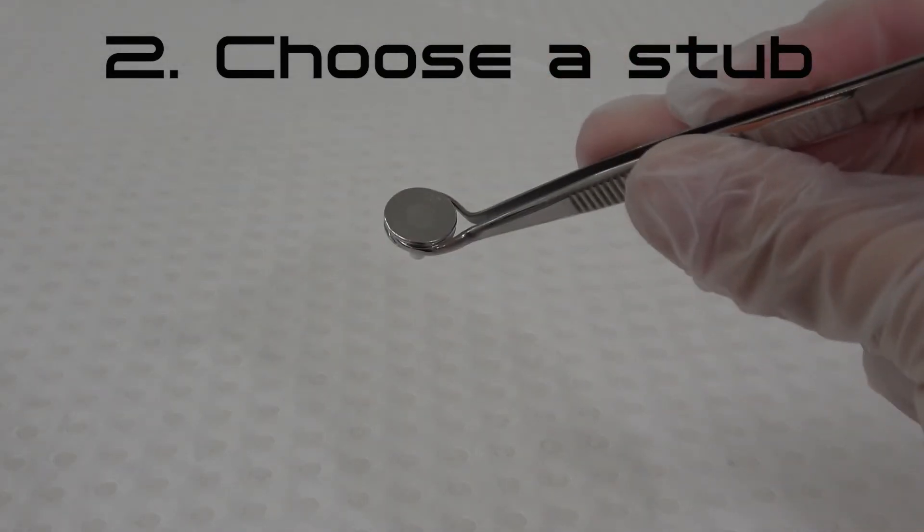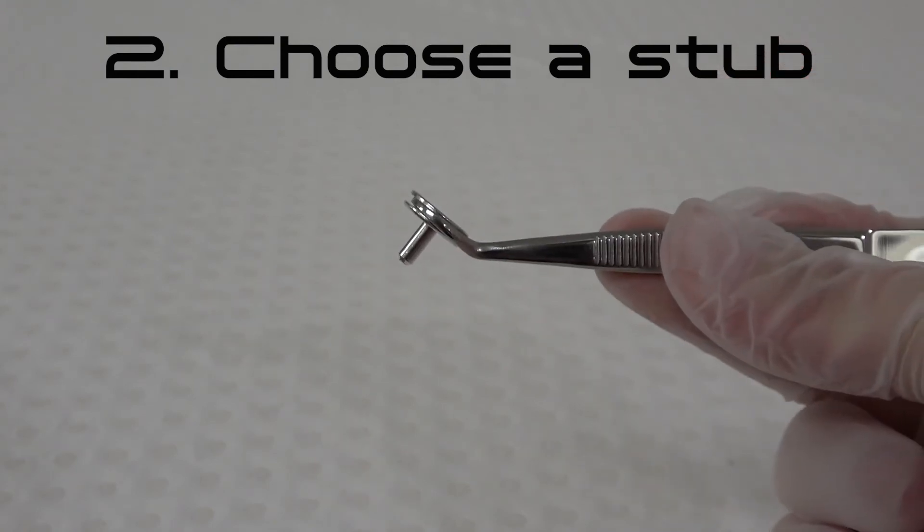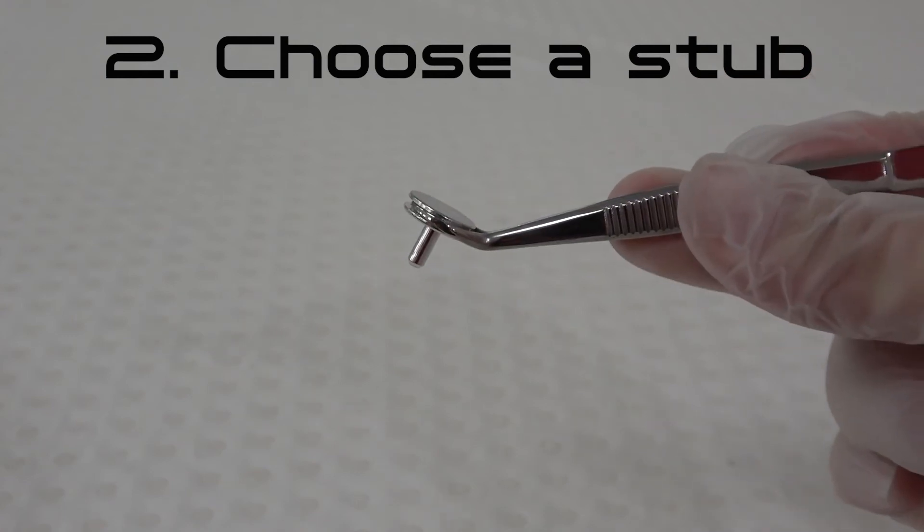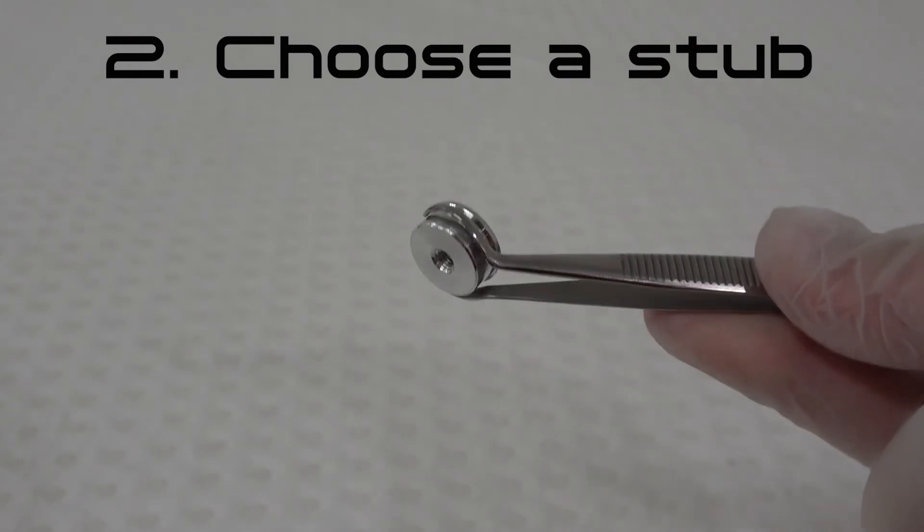Step 2. Choose a stub compatible with the SEM you will be using. Small SEM stubs available through the UNSW EMU currently include 12.6 mm pin stubs and 15 mm screw thread base stubs.